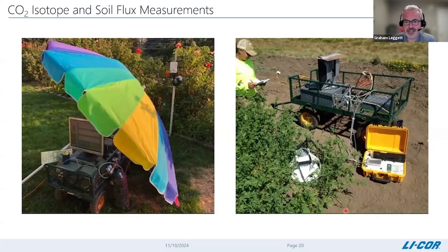Typically it's a mains powered laboratory instrument. You can see this one requires a monitor to actually operate the instrument in the field. It can only be used during certain weather conditions. These instruments are not weatherproof, and can only be used in a very narrow temperature range, typically like a laboratory setup, so maybe 5 or 10 degrees up to 30 degrees C. So definitely not ideal in quite a wide range of environments and temperatures.